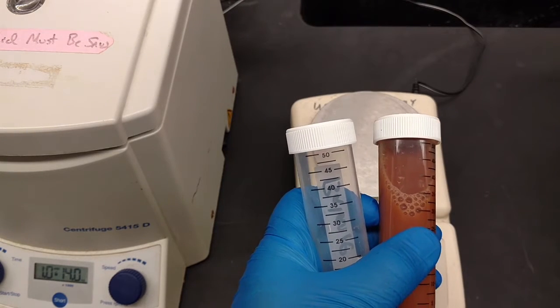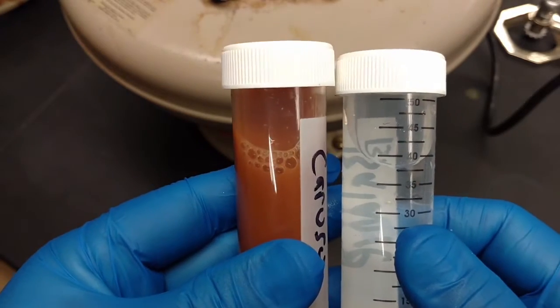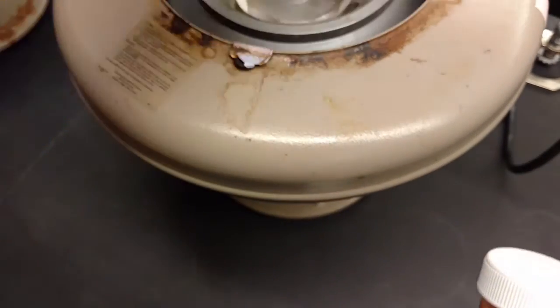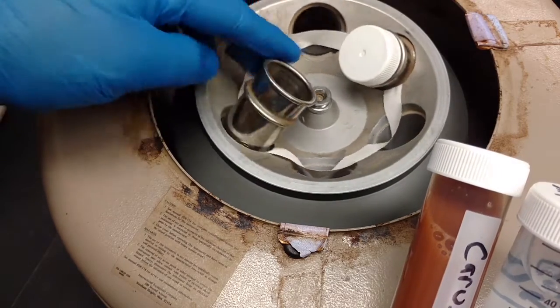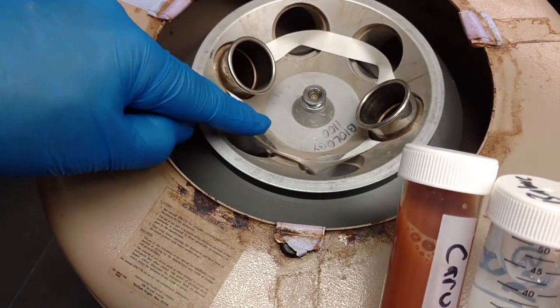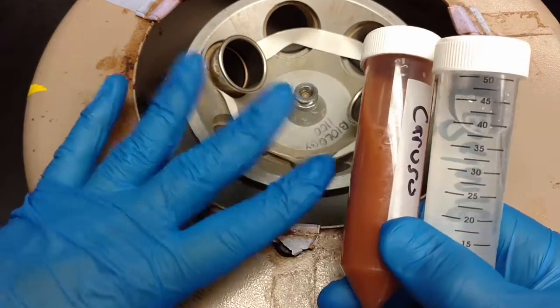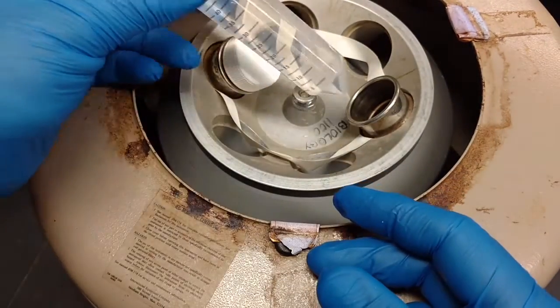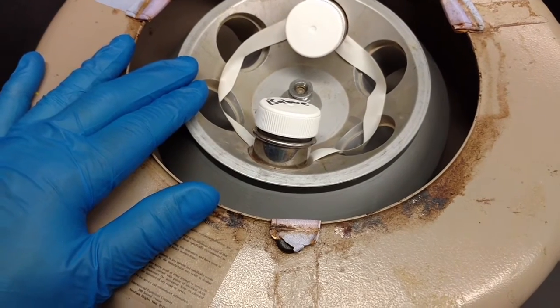We've filled up the balance tube with water up to about 46 mils — both tubes are ready. We have tabletop centrifuges in two different sizes: some that hold 50 mil tubes and some that hold 15 mil tubes. Always put your tubes in one of the sleeves, never in the empty holes that hold the sleeves, because if you do your tubes will shatter. Always balance a centrifuge — put tubes opposite each other.